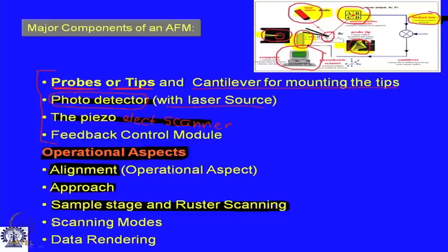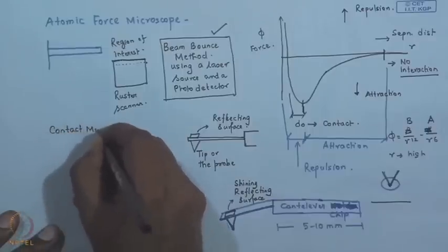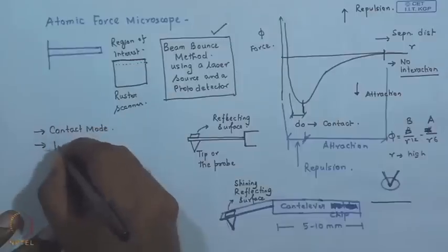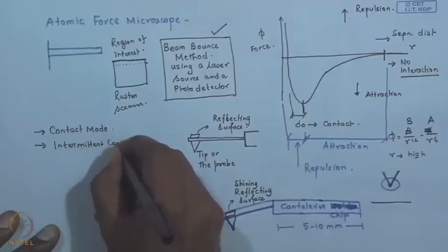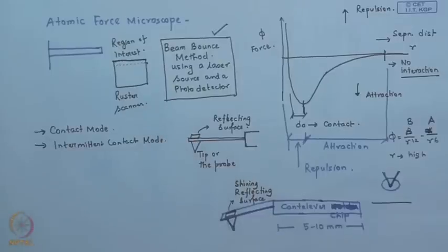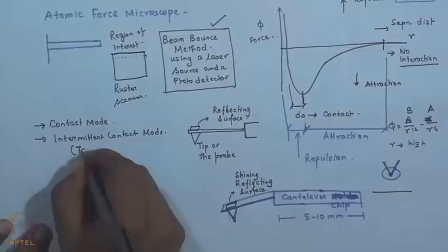Then finally, of course, we talk about the scanning modes, which is very, very important. And we will discuss in greater detail the operating principle of two of the modes. They are the contact mode, the simplest one, and the intermittent contact mode, which is more widely known or more popular as the tapping mode.